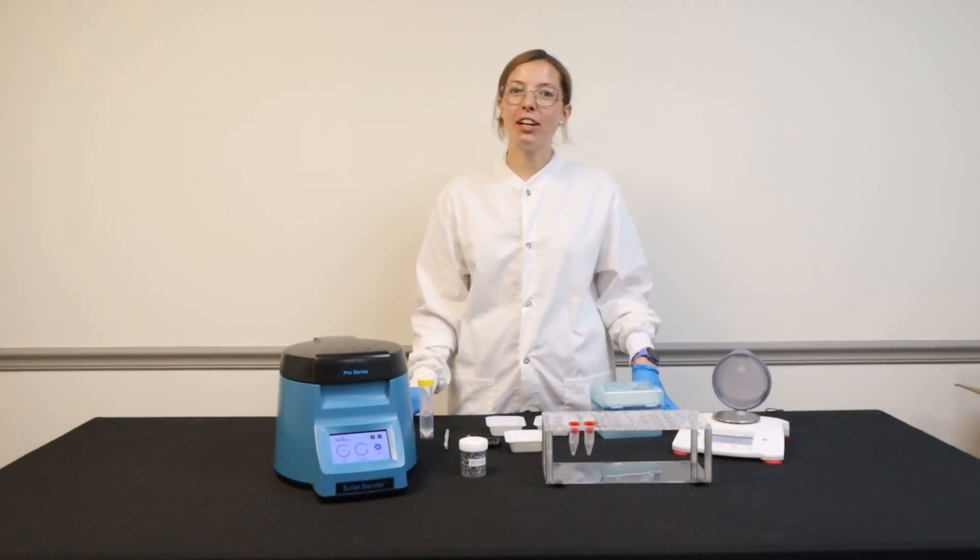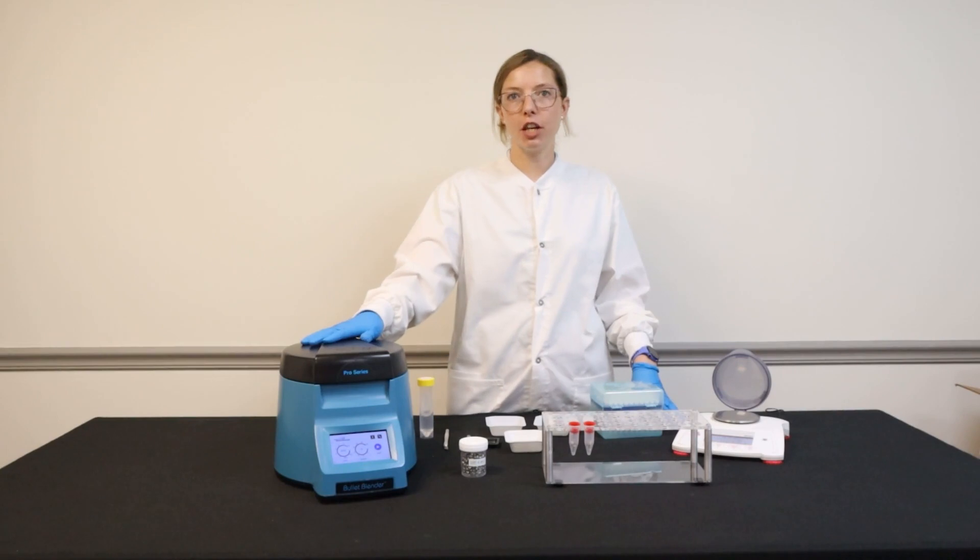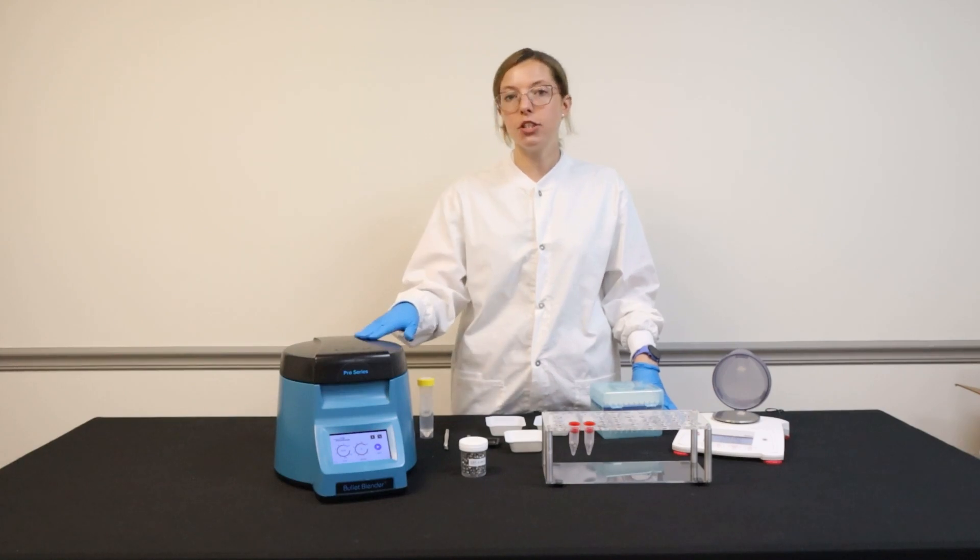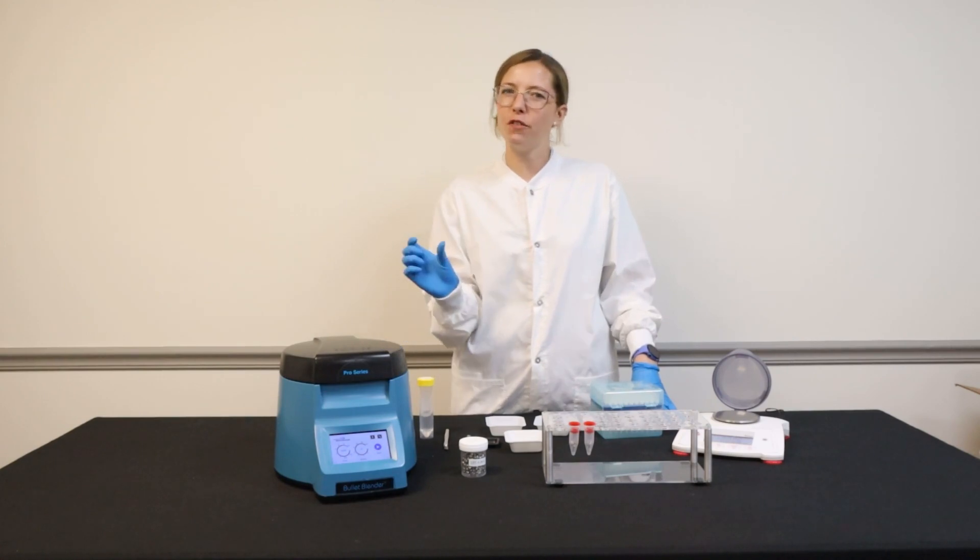Hi, my name is Nikki and I'm here with Next Advance using their 5E Bullet Blender to homogenize larger and tougher tissue samples. This instrument can handle up to 1 gram of tissue sample per tube and it's good for tougher samples like fibrous plant material, umbilical cords, or muscular tissue.